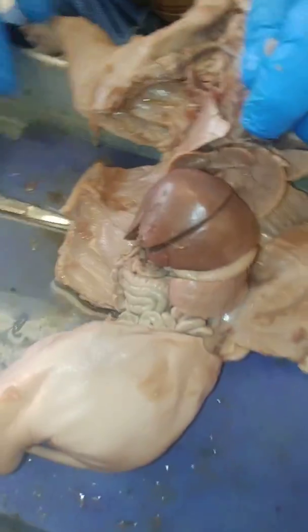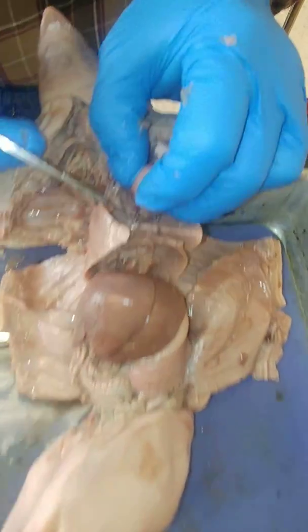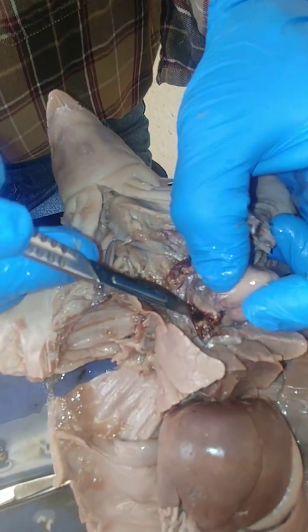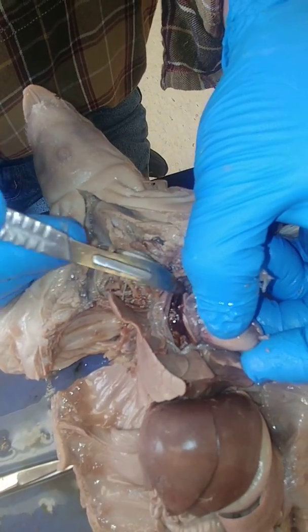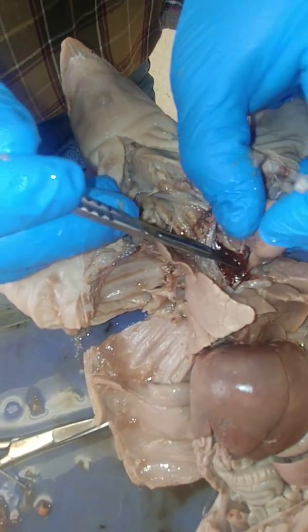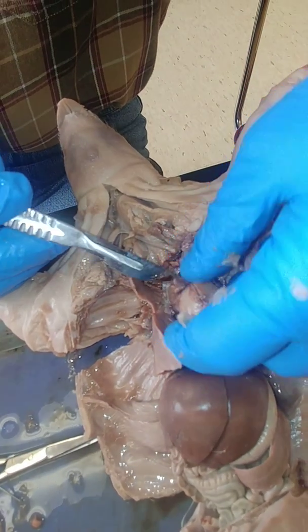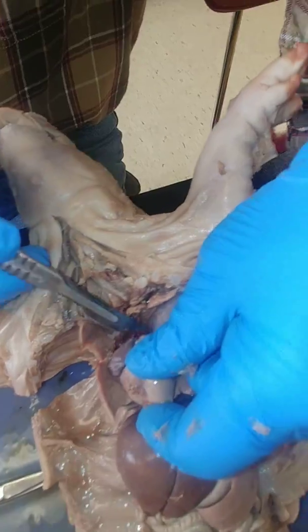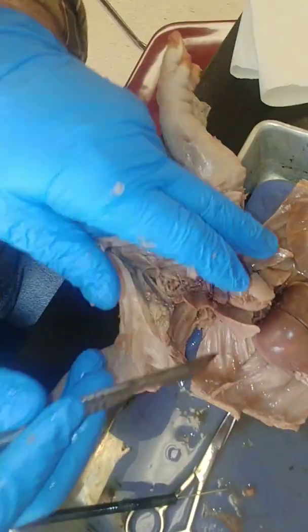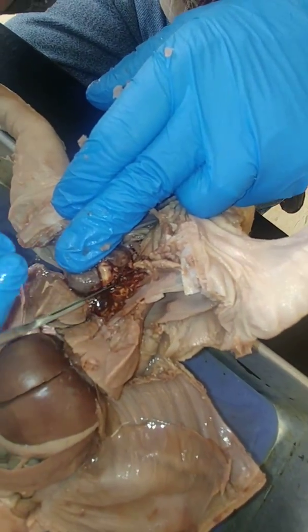Okay, I'm going to remove the heart. And you've got a little bit of loose blood because this pig had its own circulation going when it was inside its mother. And so the blood that was in the baby pig is not blood from the mother. This pig made its own blood.